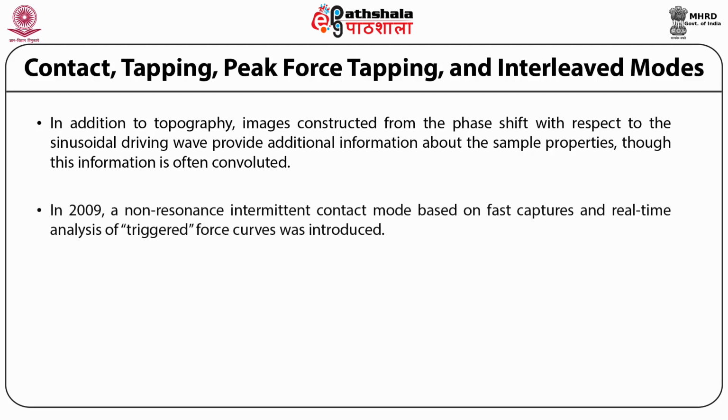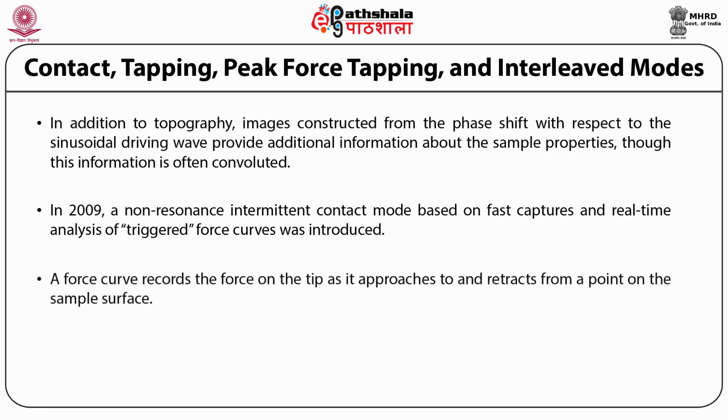In 2009, a non-resonance intermittent contact mode based on the fast capture and real-time analysis of triggered force curves was introduced. A force curve records the force on the tip as it approaches and retracts from a point on the sample surface.